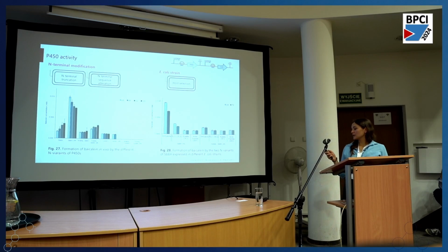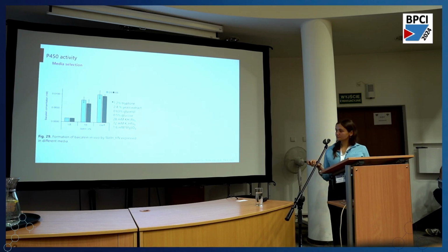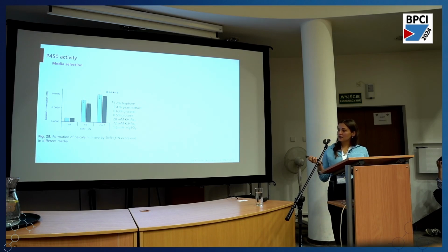So knowing that, we focused on media selection, and in that test, a modified version of TB named dynamic media gave us the best baicalein production.